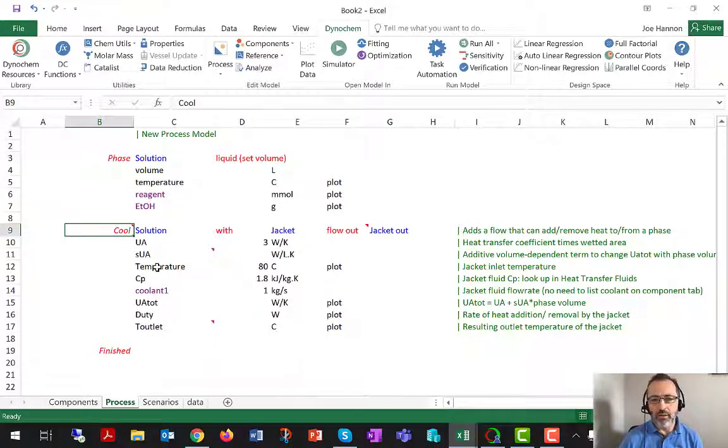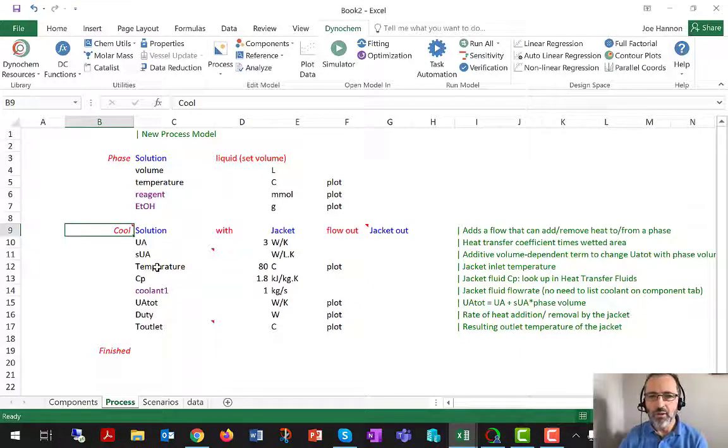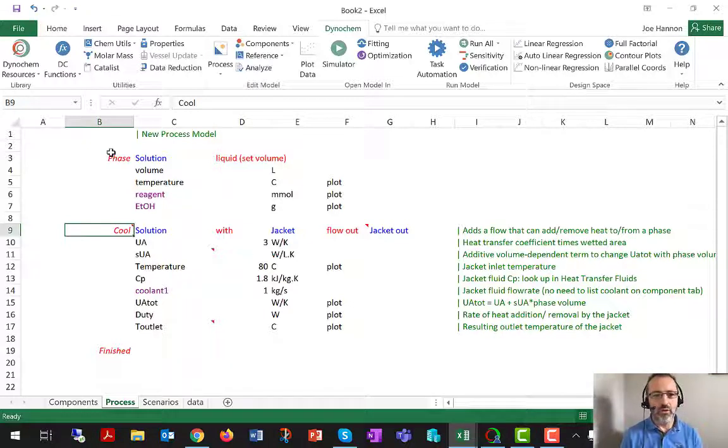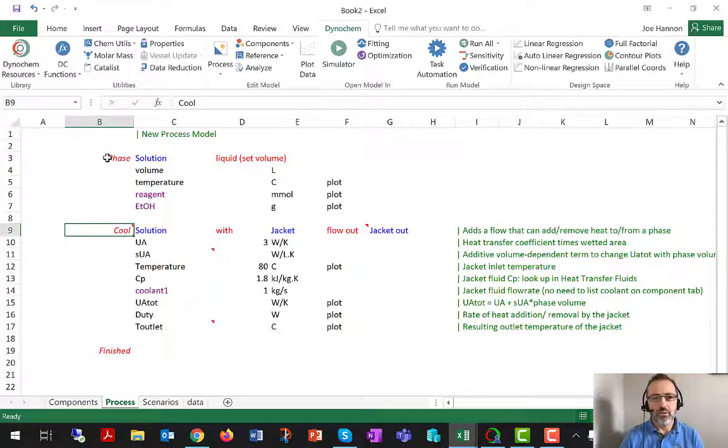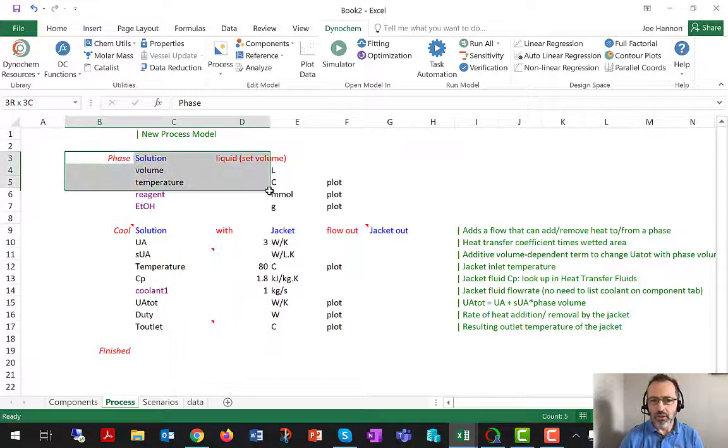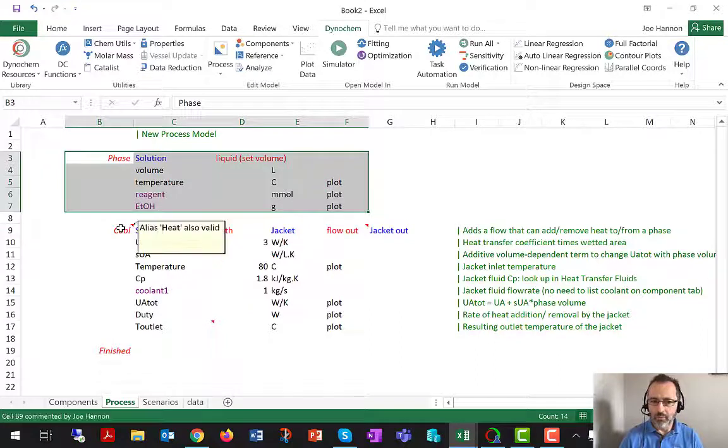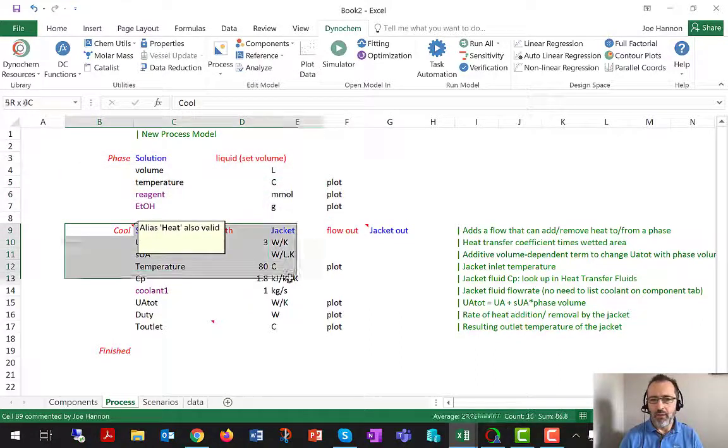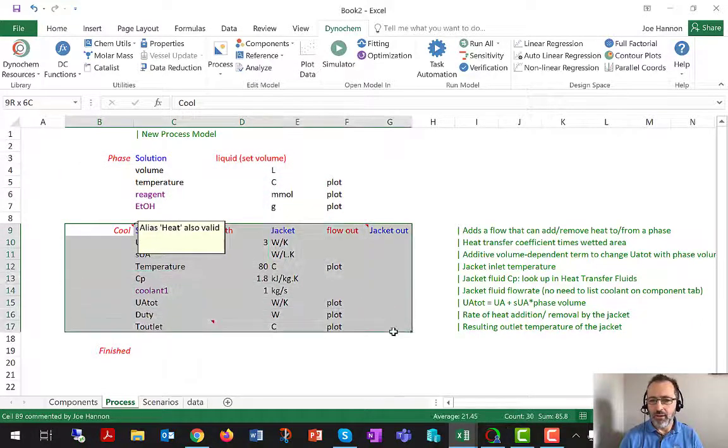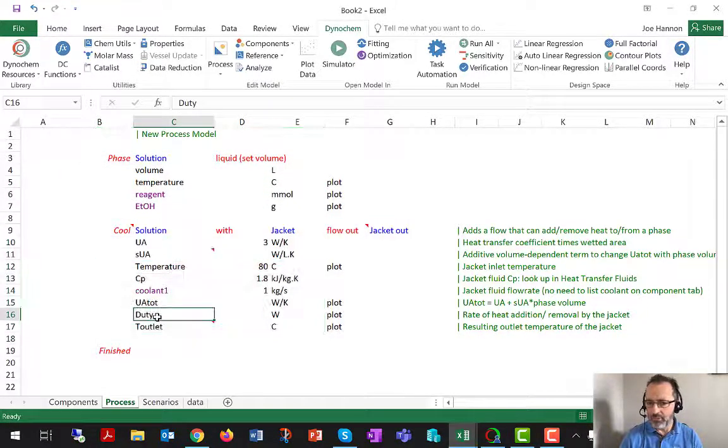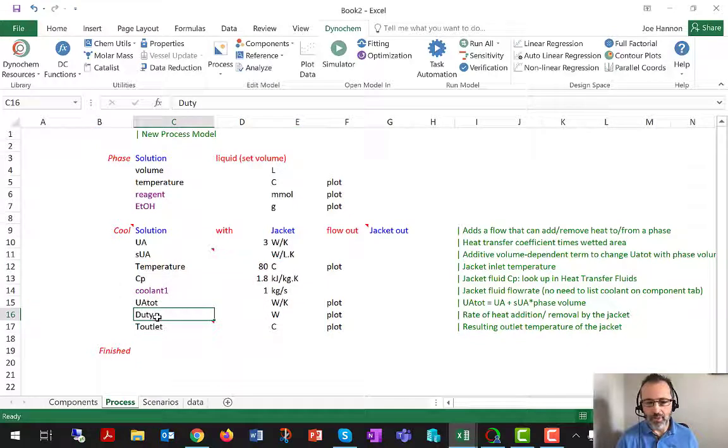We're back in the Excel document Book 2 that we created in the previous video, where we added to the process sheet a cool statement, and that allowed us to simulate how long it would take to heat up this particular batch of material.